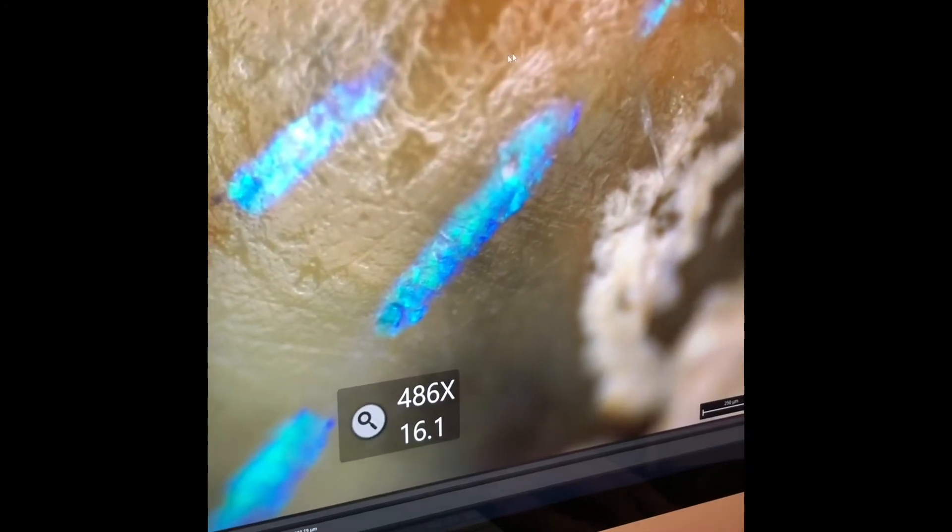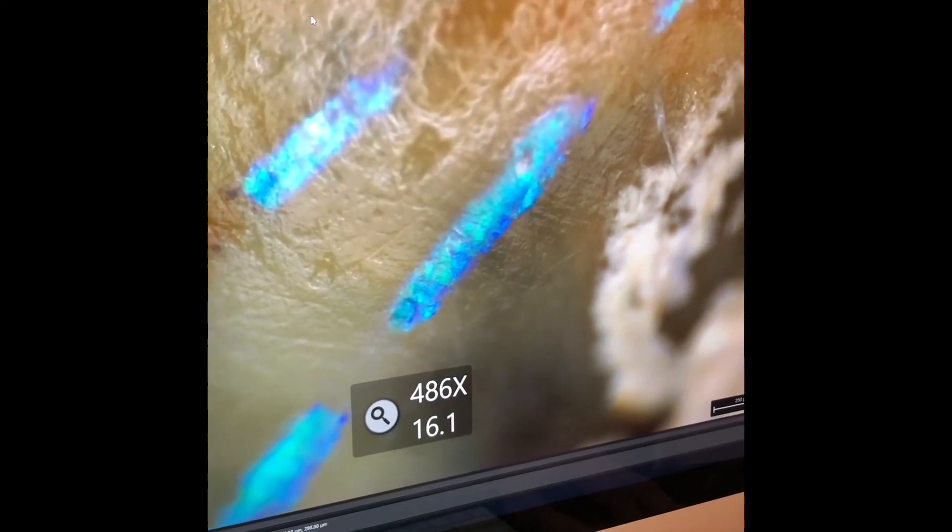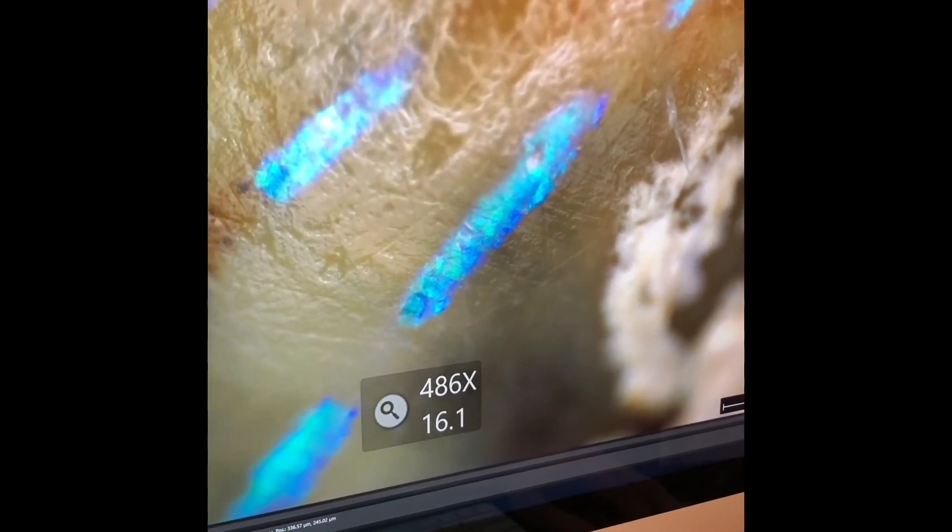And then you can start by pressing the triangle again, and going to other regions in order to get as much information through your imaging as you want.